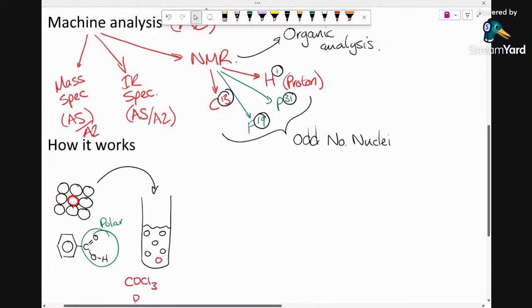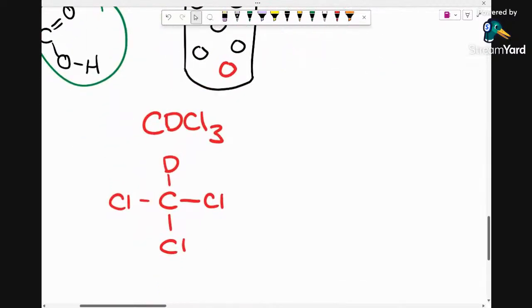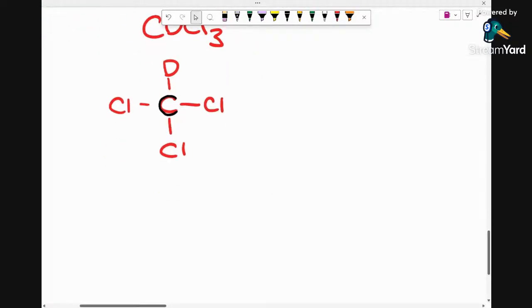Now, the reason why we're doing this is because we want to make sure that the hydrogen, when we're using this for something like proton NMR, doesn't make an appearance in the data. Now, obviously, the carbon-13 is going to appear. The carbon atom will appear in C13 NMR. However, it's nice just to add a nota bene at this point.